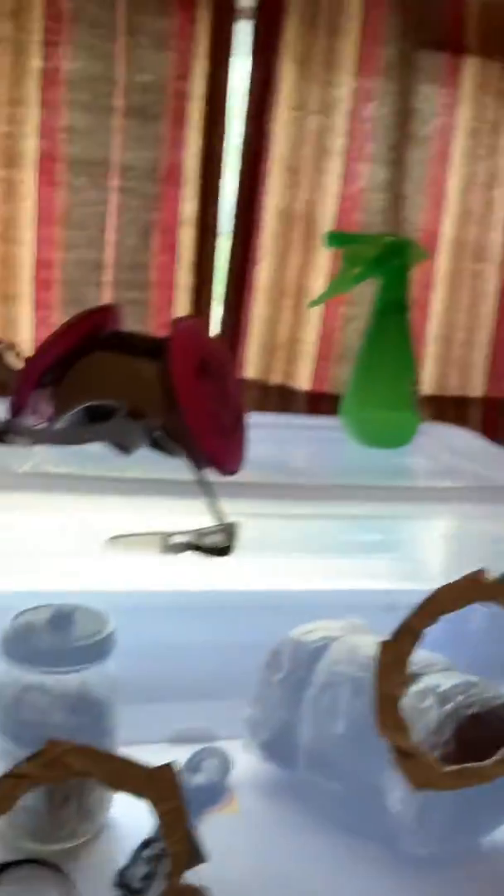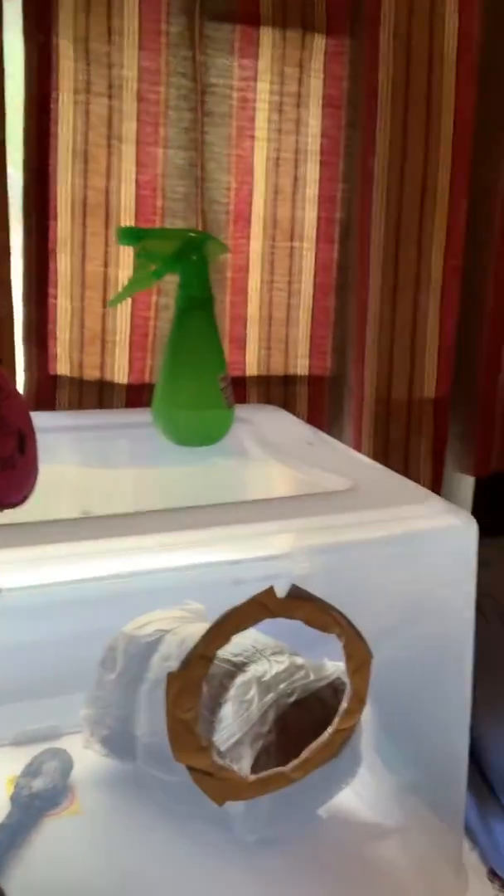We're going to start working in my steel airbox. You can see the grain and my bag, and I've got to glove up and then we'll get started.